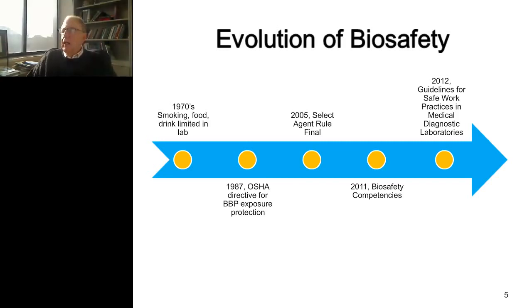Moving on to 2011, APHL and CDC issued biosafety competencies for laboratorians. And in 2012, another MMWR, the Guidelines for Safe Work Practices in Medical Diagnostic Laboratories, was introduced.